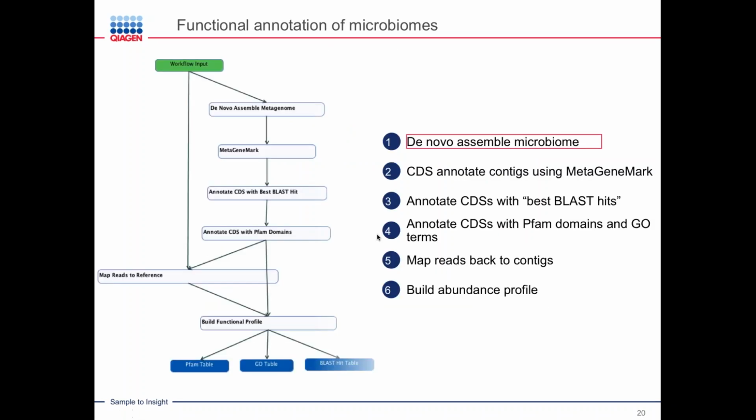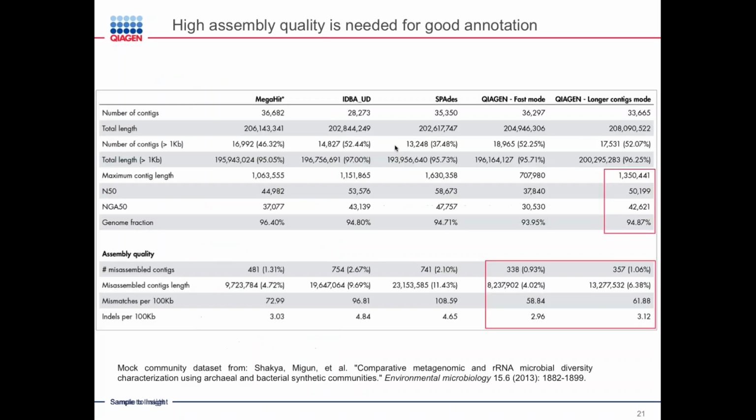Good. So I think the reason this pipeline works so well, as we've just seen, is really because of the metagenome assembler that we developed specifically for this project, or for this functionality. And we did some more benchmarks on the metagenome assembler, and they're summarized here.